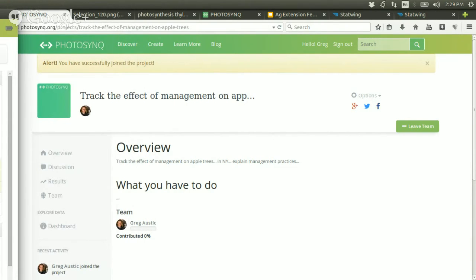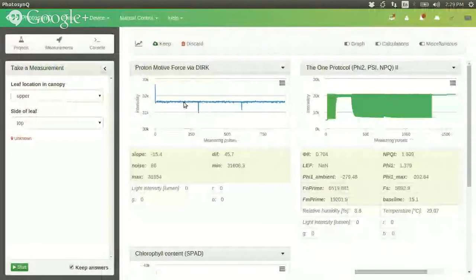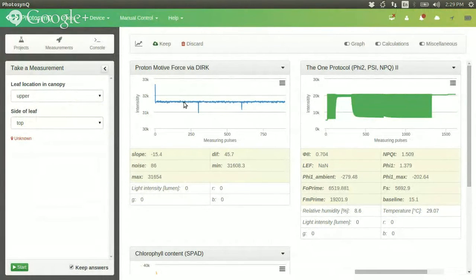But I'm actually going to collect the data on the Chrome app. So this does the same function. It connects to the device I just showed you using USB. Hang on, I need a USB cable here. Can I have a USB cable?